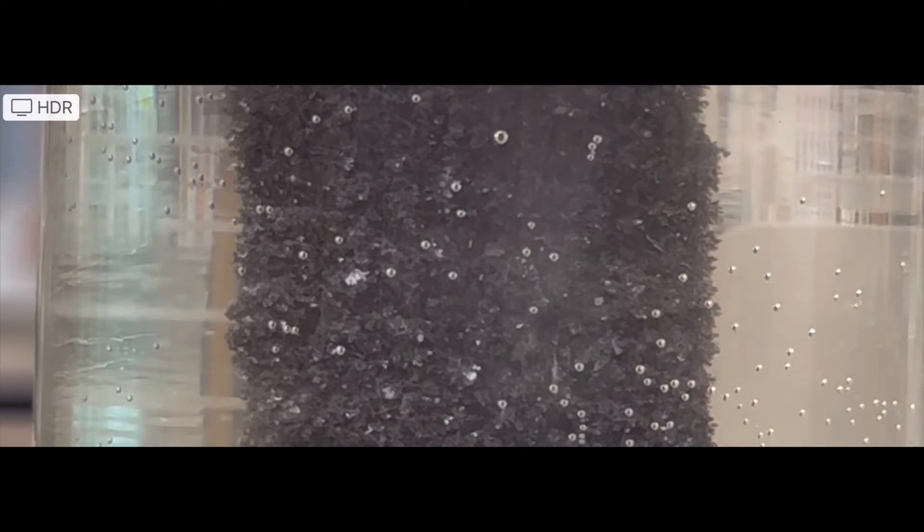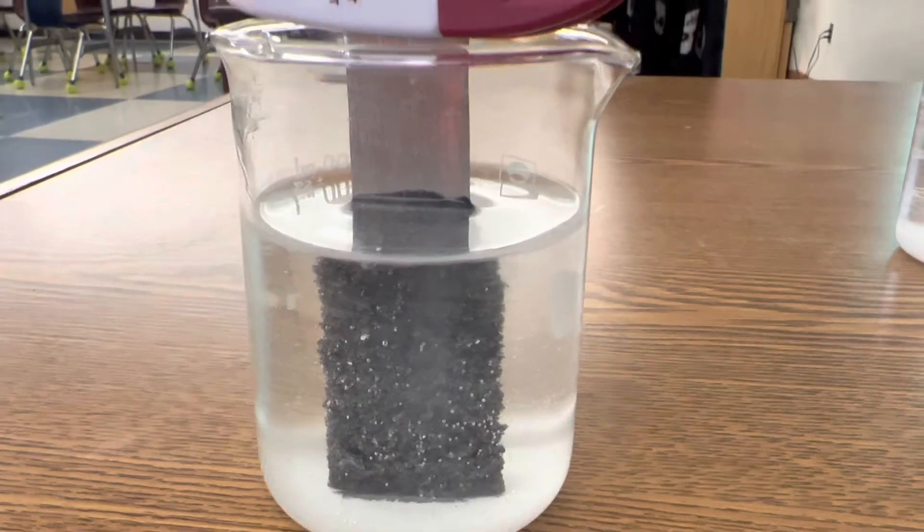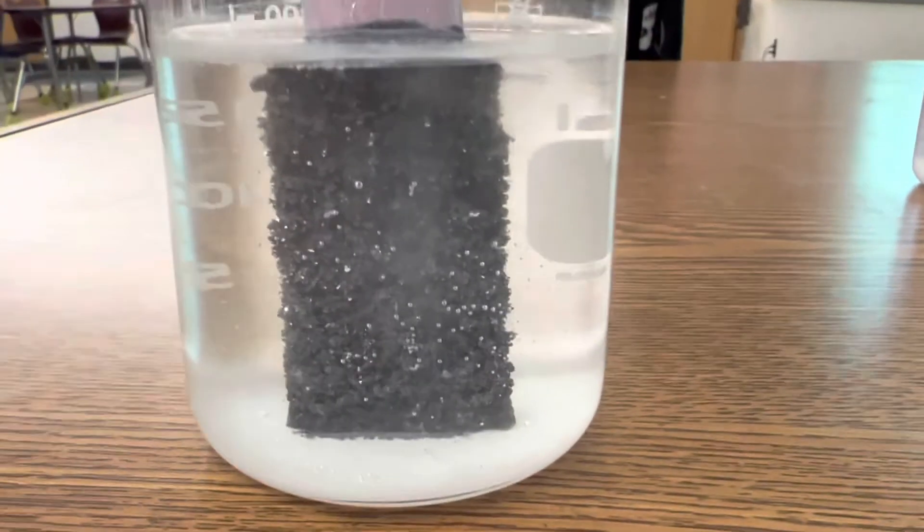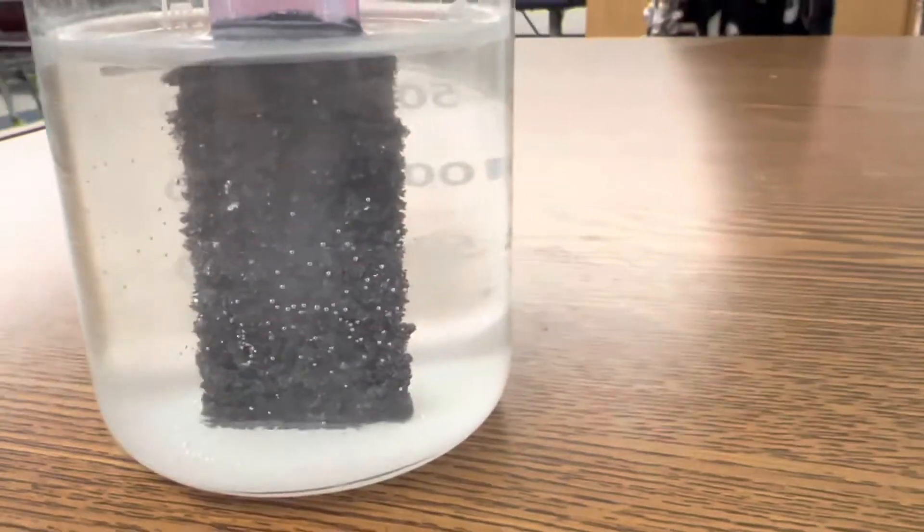Just amazing. So from this angle, you can see that zinc strip on top. Look how much the bottom has changed with all of those lead crystals that have grown.